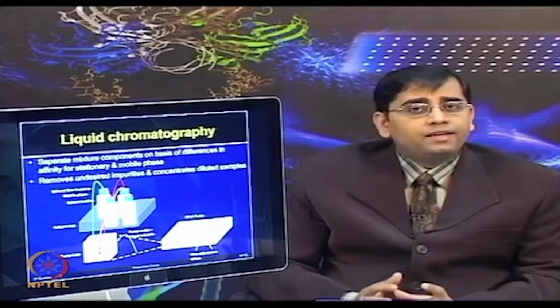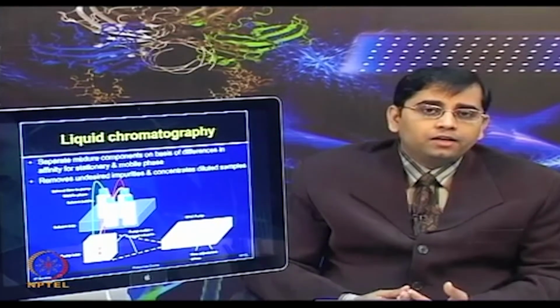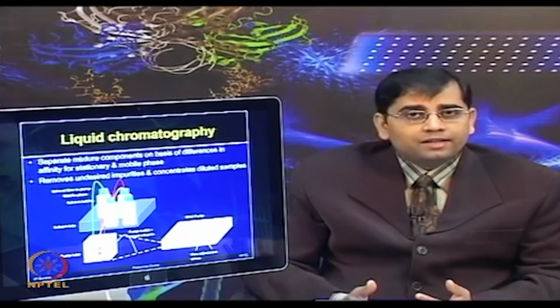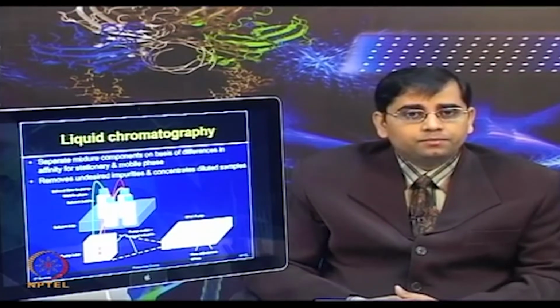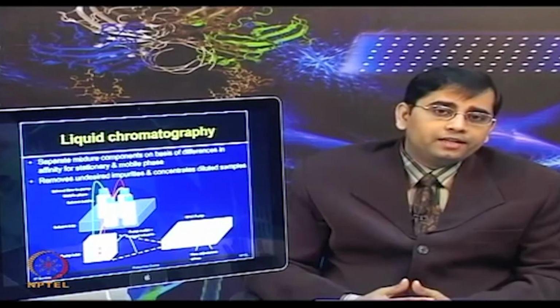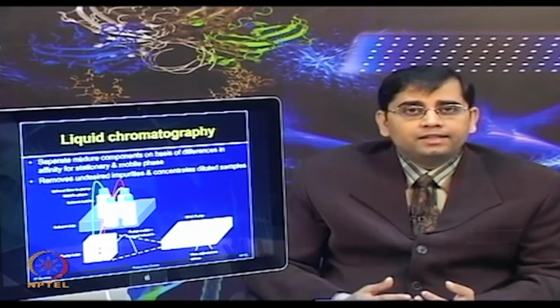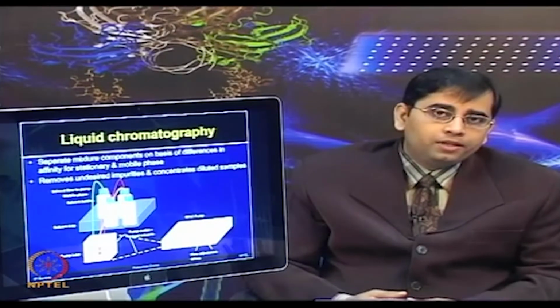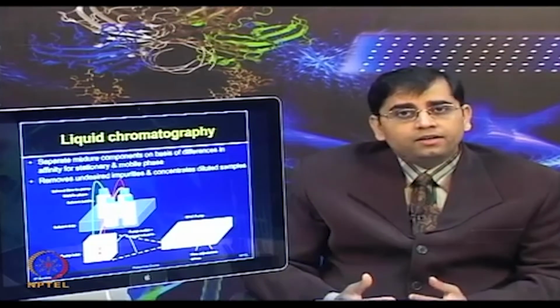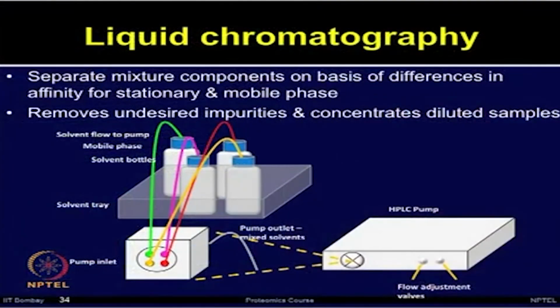Therefore, for various types of mass spectrometry-based applications, it increases the reproducibility and robustness for analysis of peptides and proteins. It also concentrates the diluted samples, and therefore it increases the detection sensitivity for low-level proteins when you are applying different types of proteomic technologies. It is mostly used for separating peptide mixtures.